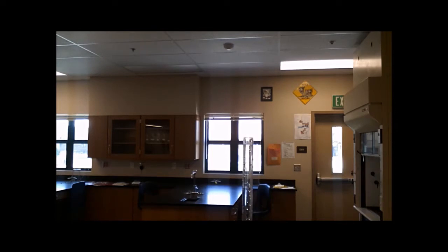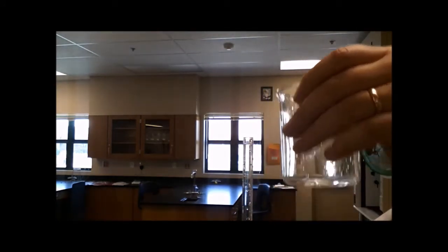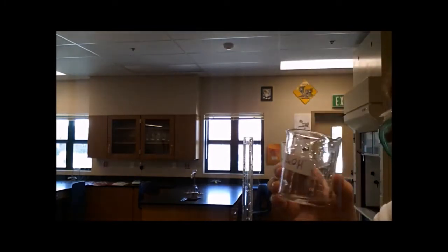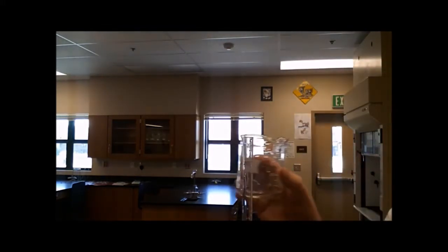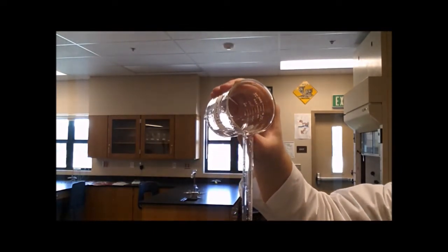And we're going to put the acid in the Erlenmeyer flask, and it doesn't really matter which way we do it unless we're working with phenolphthalein. If the indicator is phenolphthalein, we generally want to put the sodium hydroxide in the burette and the acid in the flask, for reasons which I'll explain later. So one of the ways to get the sodium hydroxide into the burette is to put it into a beaker. The advantage of the beaker is it's got a lip on it, so it's going to make it easy to pour. So I can take the beaker and pour it into the burette.